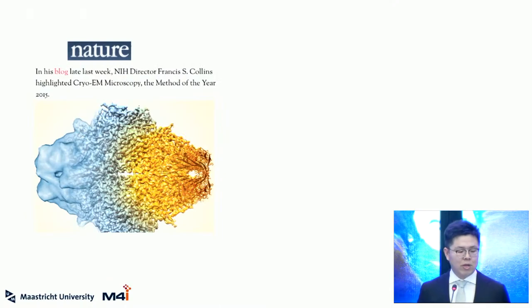Cryo-EM has become a very important tool for structural biology, and in 2015, Nature highlighted cryo-EM as the method of the year. A decade ago, cryo-EM was referred to as blobology because we could only get blobs for protein structures, which means no resolution. Since 2013 and the resolution revolution, we can get high-resolution structures of proteins. We can solve each individual amino acid there. And nowadays we can even get atomic resolution, where we can see each individual atom.